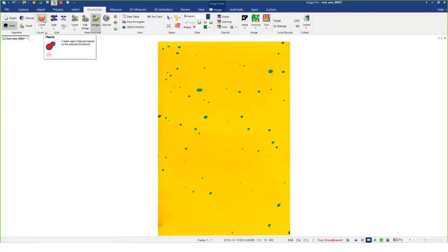Otherwise, I've seen people do it. They record the steps, they record setting all these parameters, and then when they go to run it, all of a sudden, maybe 2 weeks later, someone else was using this program in a multi-user facility. They were setting things up completely differently, and Image-Pro remembers its last settings. By using this file, everything's put back into that known state. All right.